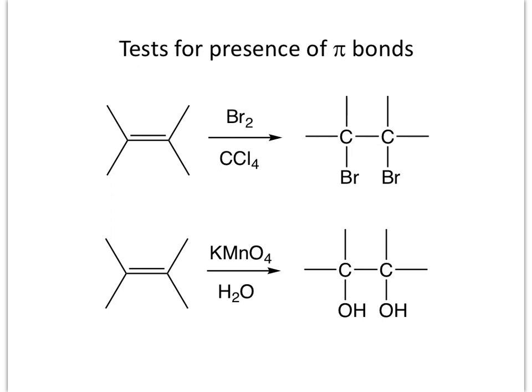Okay? Now, before we go to the GC, we want to make sure we have alkenes. And so we have two ways that we're going to do a quick test for the presence of alkene in our product mixture, right? Because the methyl cyclohexanol is a clear liquid. Our products are clear liquids. How do we know whether a reaction really occurred? And remember, that's one of the things that we try to focus on in our conclusions. So we're going to do two different tests.